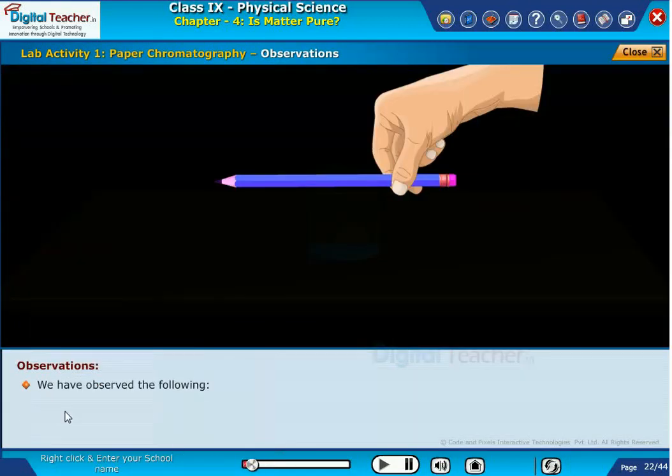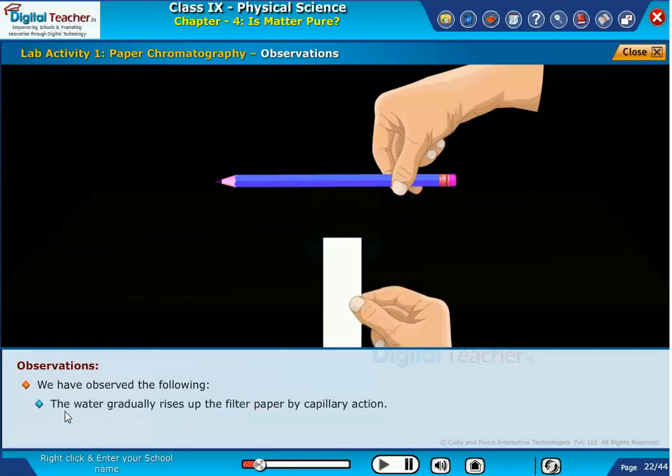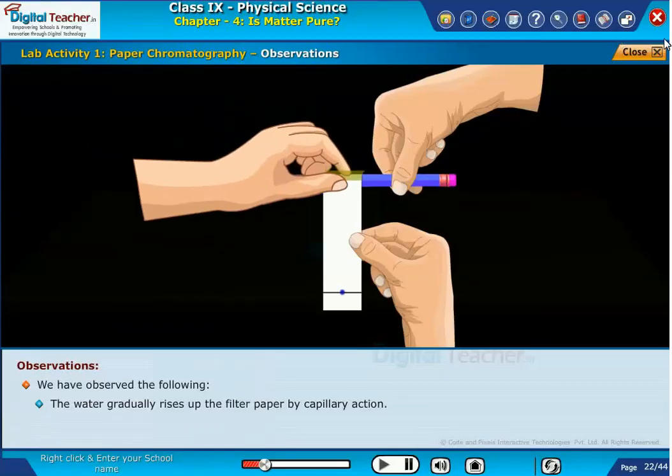We have observed the following: the water gradually rises up the filter paper by capillary action.